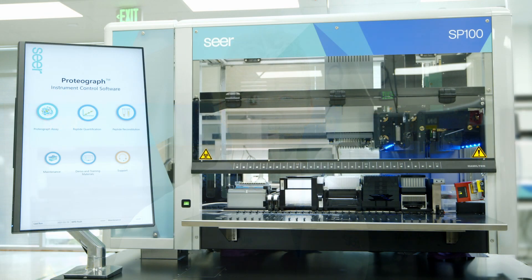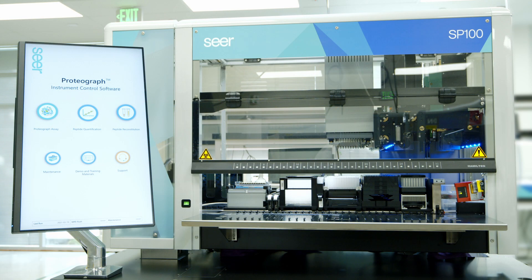We are preparing to run the SP100 Automation Instrument. First, let's take a tour of the major instrument components.